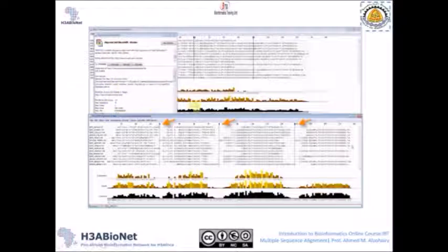So for each few columns, when we hide a region within your sequence, as the arrow shows, the alignment happens independently within these sequences. As you see, this part has been aligned independently from this one, from this one, from this one. It's like sectioning your alignment and your sequence, so you can see each part aligned independently from the other one.